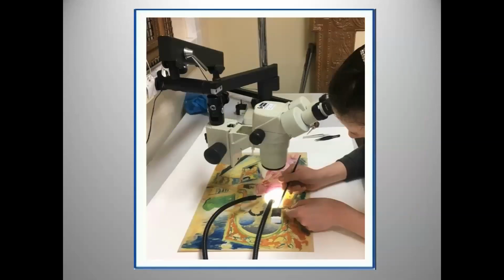FTIR ATR could take place by directly laying the artworks recto down under the ATR probe. Therefore, non-destructive analysis was possible in order to obtain an indication of whether or not protein may be dominant in the media or perhaps part of a mixture. Proving the presence of egg tempera by more particular means, such as by identifying the presence of the associated hydrolyzed amino acids, could not be obtained by non-destructive methods. Therefore, it was concluded that some minimal sampling was also required.